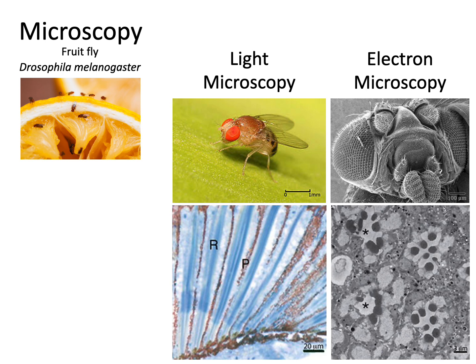And similar to the light microscopy just left of it of the whole fruit fly, it behaves in a really similar way. Except instead of a lamp throwing photons down on the fruit fly and the leaf, on the upper right we have a filament or a source that's casting electrons down. And then you have a detector that's collecting the electrons as they bounce off of the specimen.